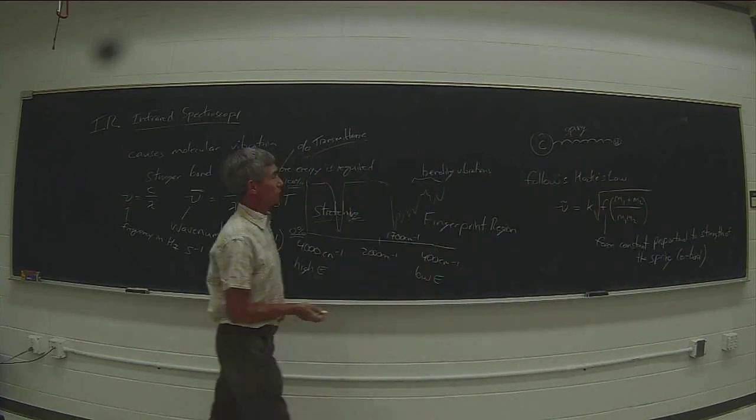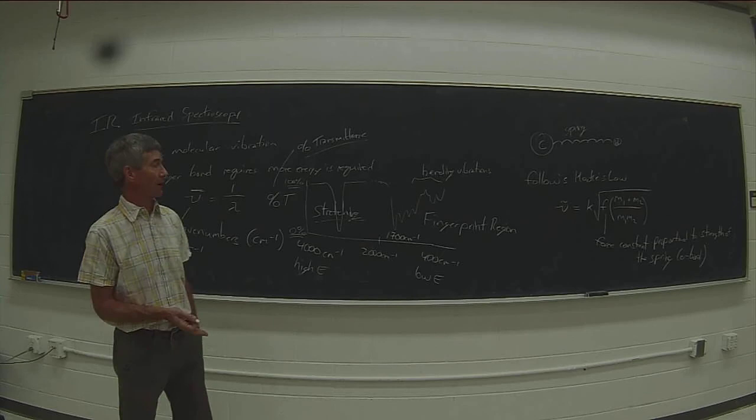We're treating it as if it's two atoms of a ball attached by a spring.